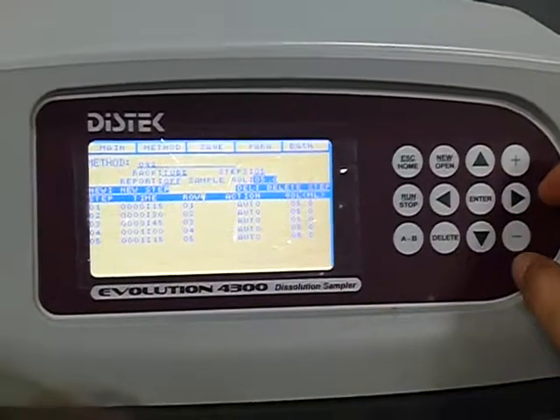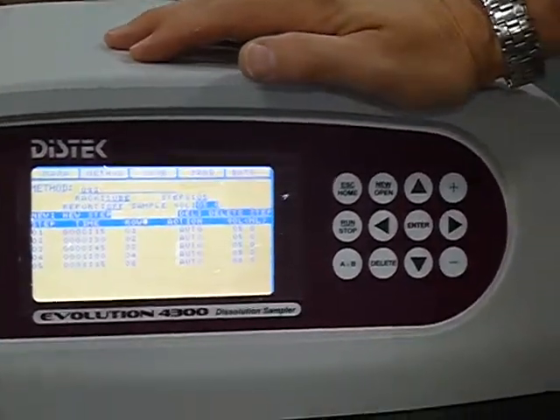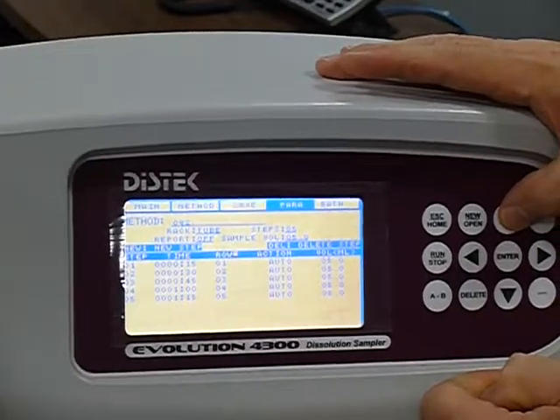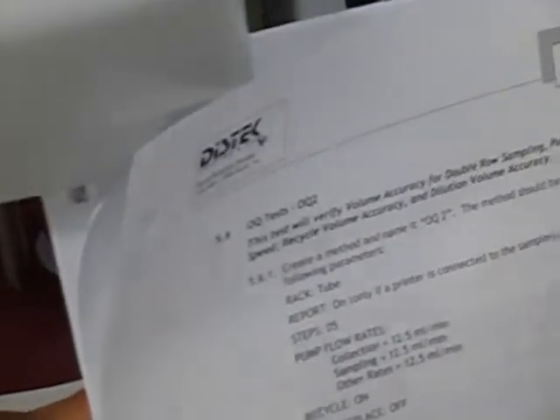No, we just pump flow rates. Where is that? Okay, you're now at 5 steps, but recycle on. See, they have you going to parameters already. Yeah, that's parameters, that's up here. I thought so. Because then you turn around and you're going back to the steps, which is kind of funny, but you have to go back to parameter. Because all flow rates, recycle, media, and all that, that's all under parameters.